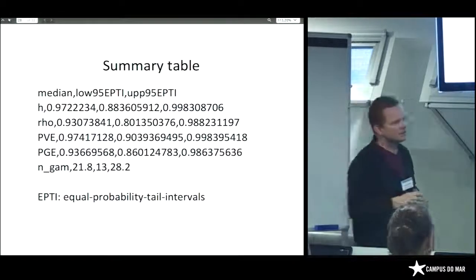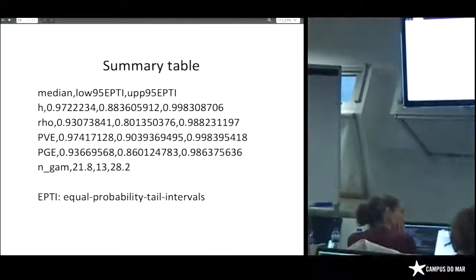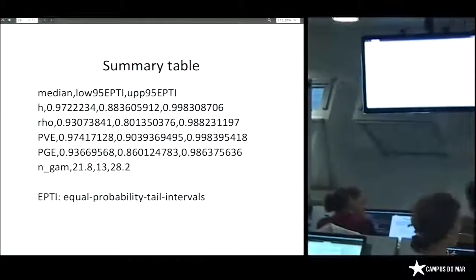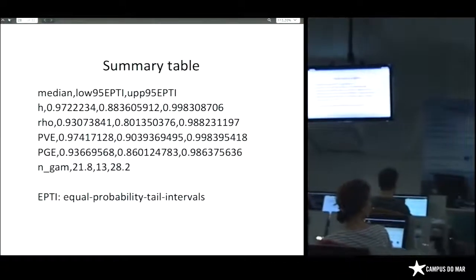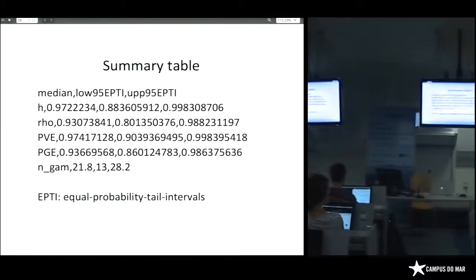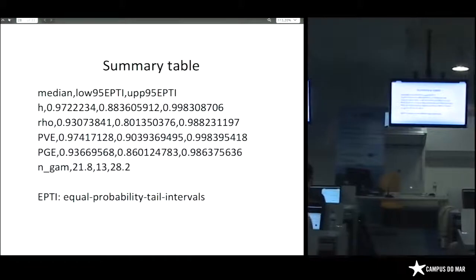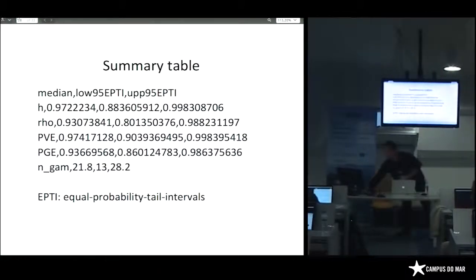Sure, one question. If we want to detect SNPs associated to a particular character, for example, a shell color, how many individuals do you need? Okay, so GWAS are really subject to ascertainment bias. The more the better. So way back at the beginning of this.